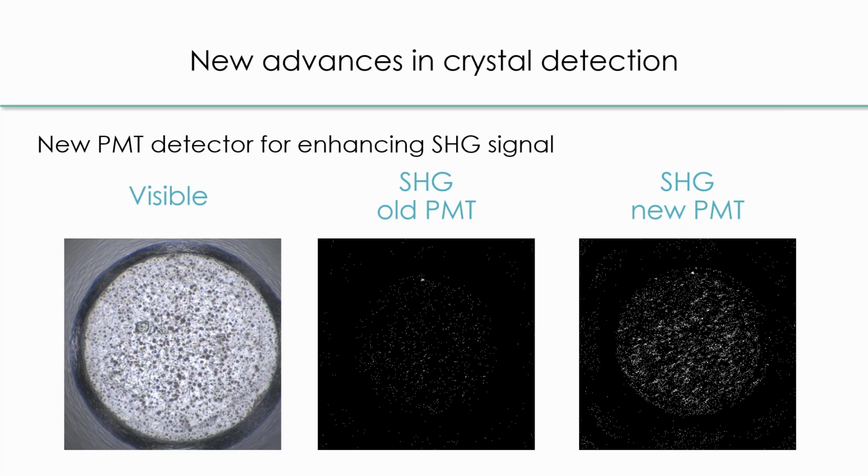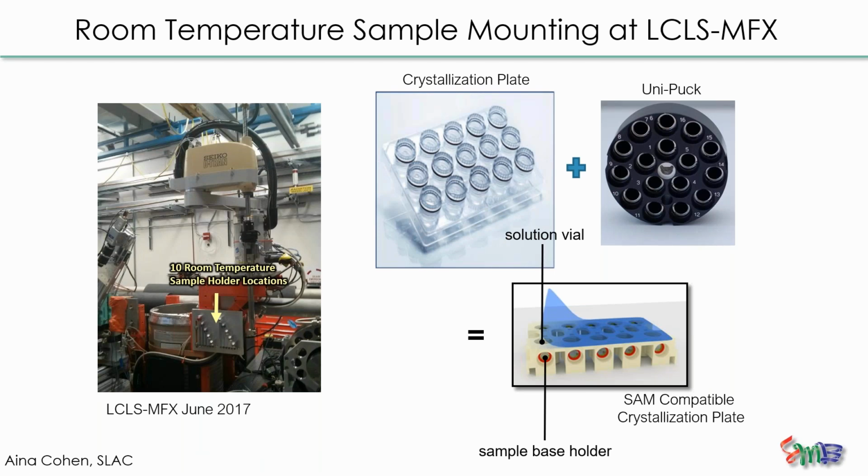that we might not otherwise identify crystals in. And I'm going to end by talking about some new work that we're doing in collaboration with scientists at SSRL and LCLS to do some room temperature sample mounting and in situ crystallization, to be able to develop crystallization that we can then ship to a synchrotron or to an XFEL source and set it up directly onto the beamline without any manipulation or handling.